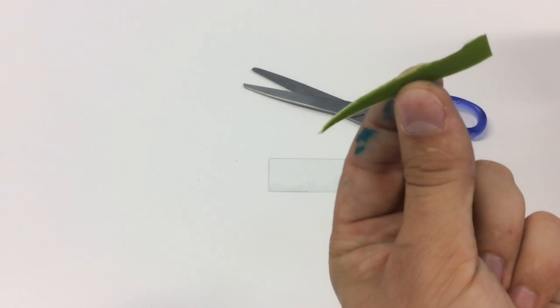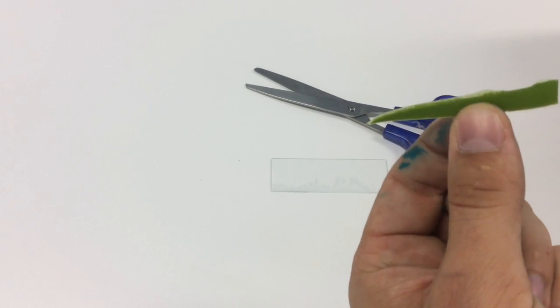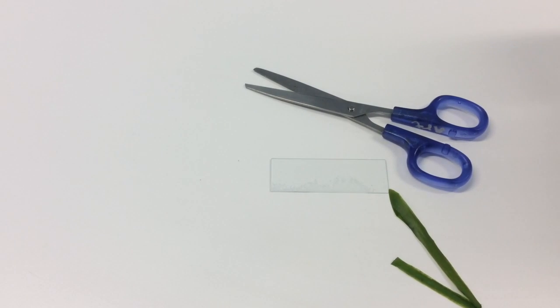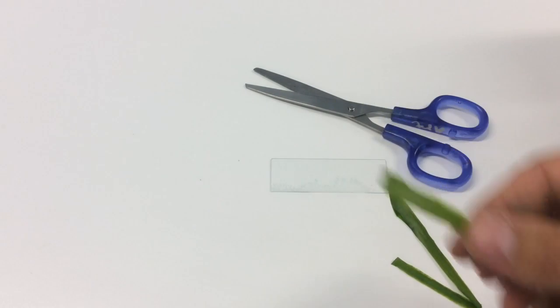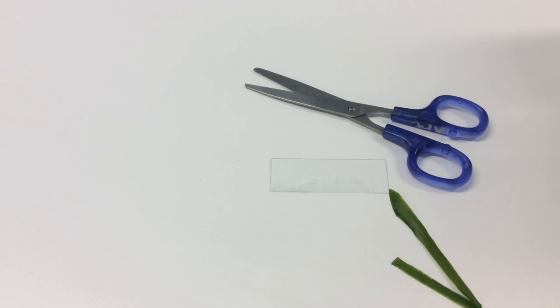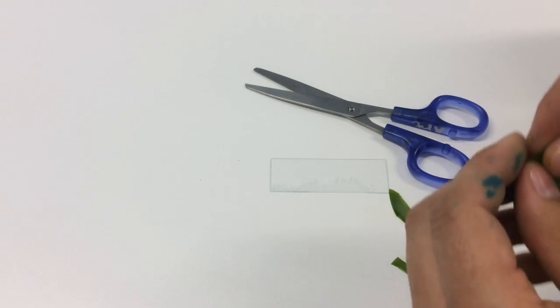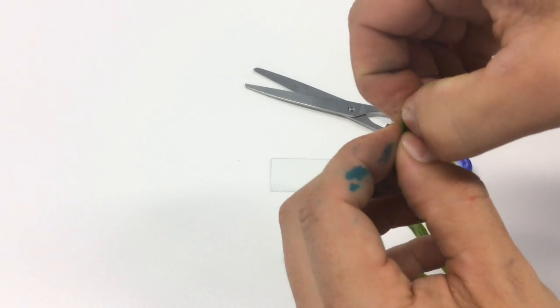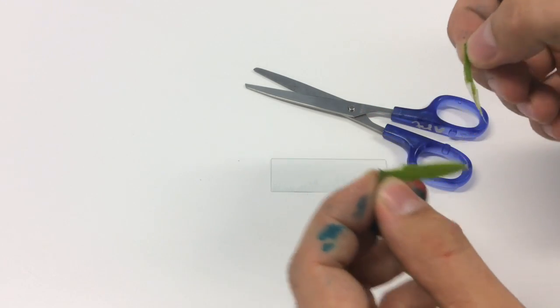Okay, so what you're trying to do is get a fine piece of your object to view under your microscope. So what I've done is torn the leaf in half like this.